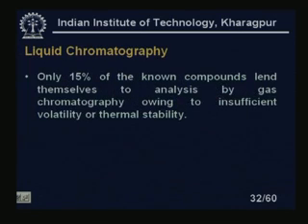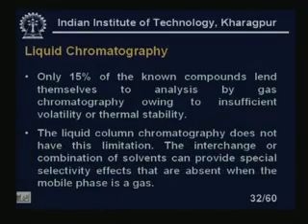Liquid chromatography. Let us note that only 15% of the known compounds lend themselves to analysis by gas chromatography, owing to insufficient volatility or thermal stability. This is the most important point: the sample should vaporize, as we have said every time. Liquid column chromatography does not have this limitation. The interchange or combination of solvents can provide special selectivity effects that are absent when the mobile phase is a gas.